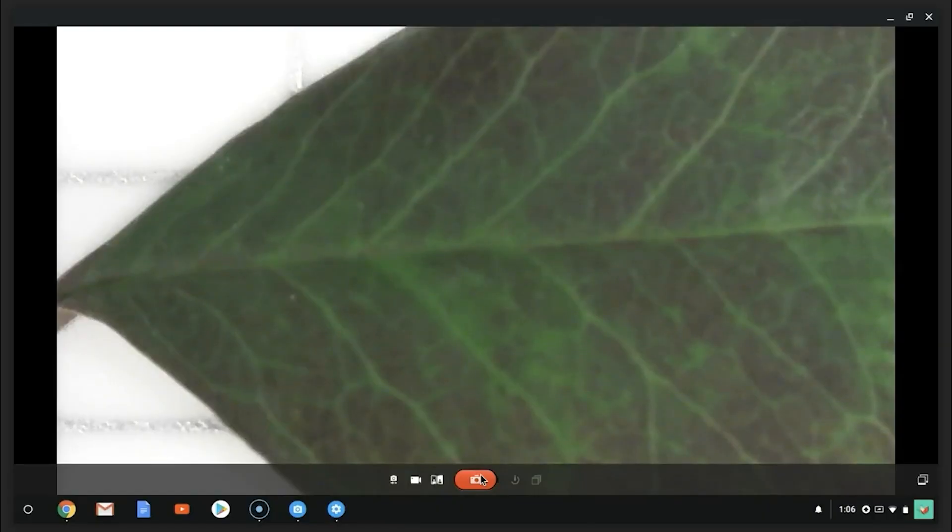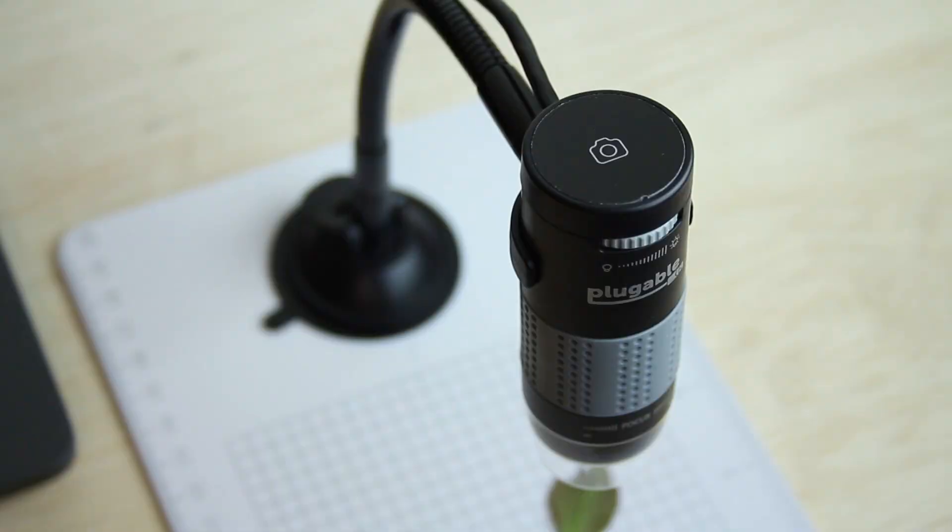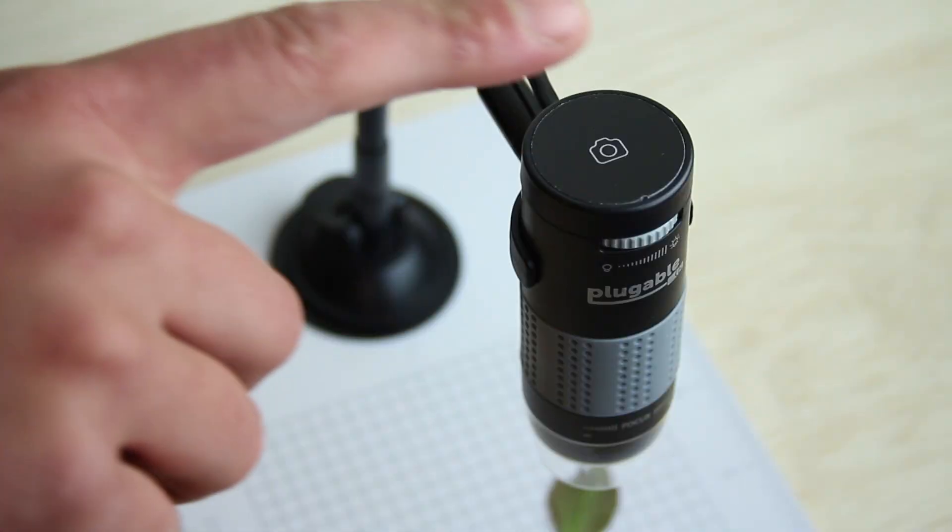To take a picture, click on the red camera button. Or, touch the Capacitive Camera button on the top of the microscope.